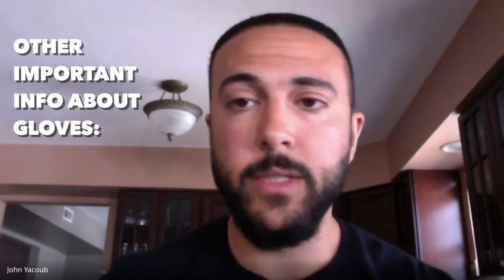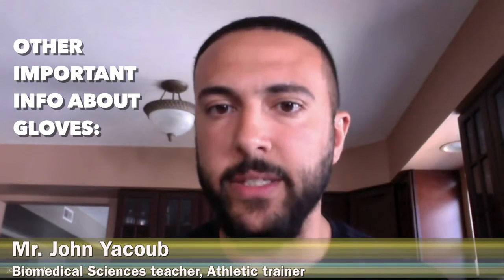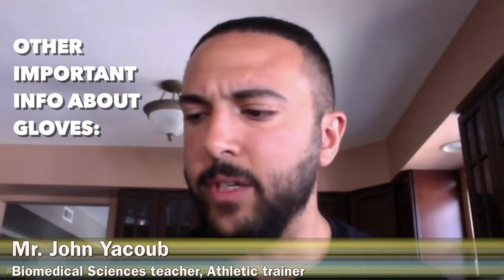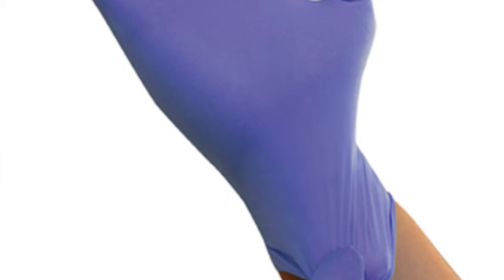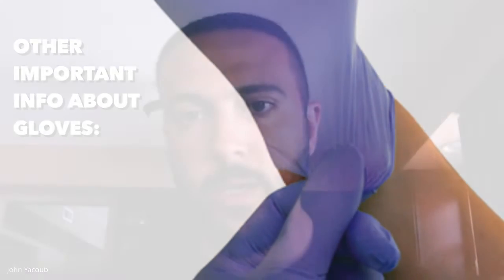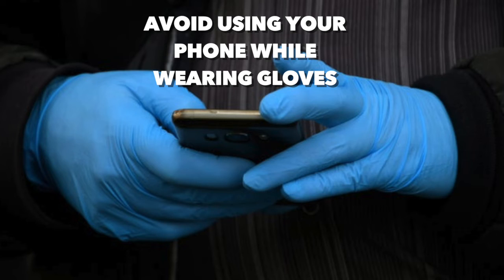Wow, that's very cool, Mr. Yacoub. I don't think a lot of people realized how quickly germs spread across surfaces or from person to person, so wearing and taking off gloves properly certainly helps. One thing just to keep in mind: the gloves that are on should also serve as a reminder to not touch your face. Many people say, what if you have your gloves on and you get an itch? Seeing the gloves on your hands should remind you not to touch your face. And also try not to make any contact with your phone when you have gloves on — otherwise you'll have to remember to sanitize your phone as well.